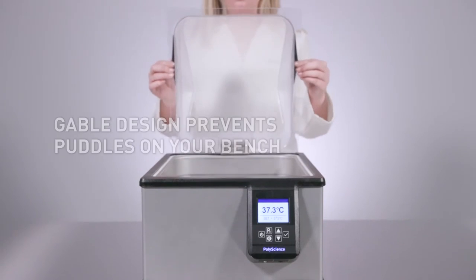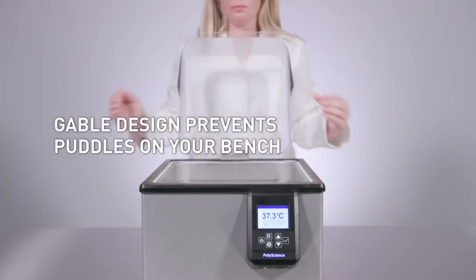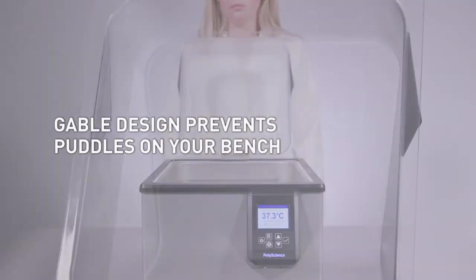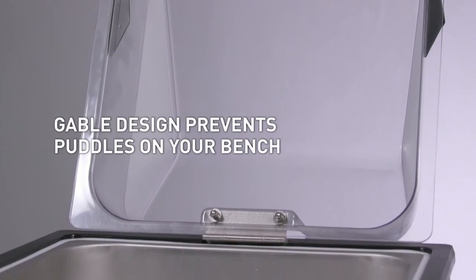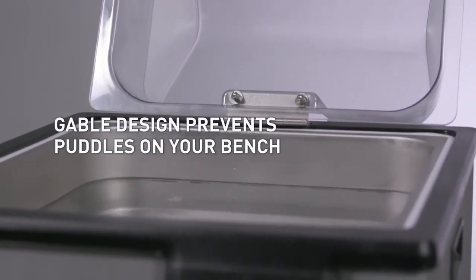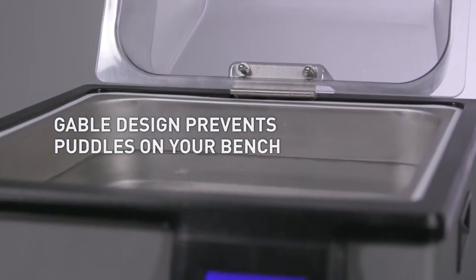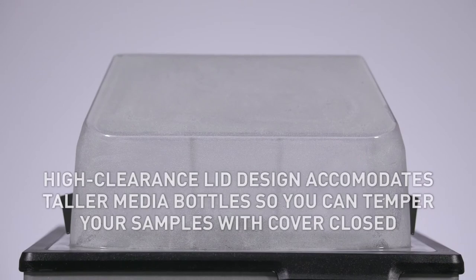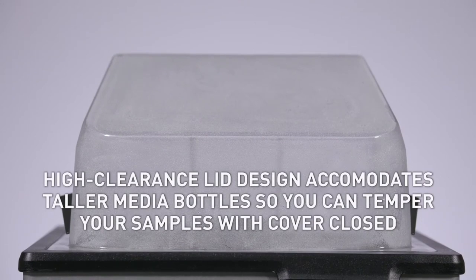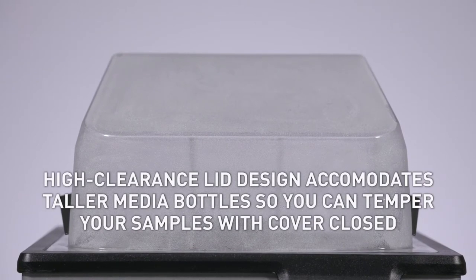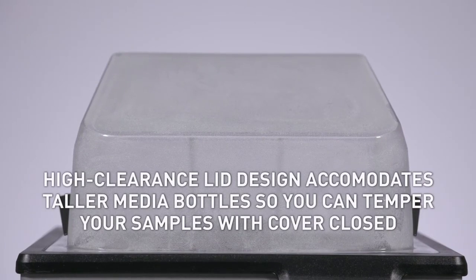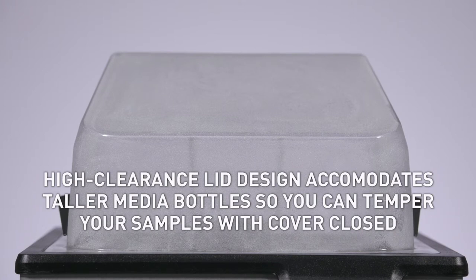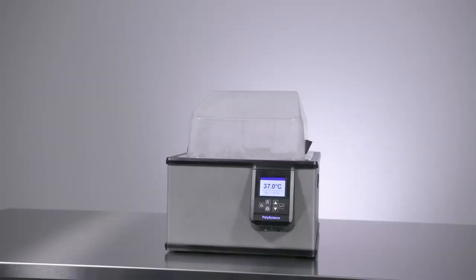This gable design prevents puddles on your bench. When you tilt the lid back, condensation drains down into the bath. The high clearance lid design accommodates taller media bottles so you can temper your samples with the cover closed and achieve improved control and uniformity.